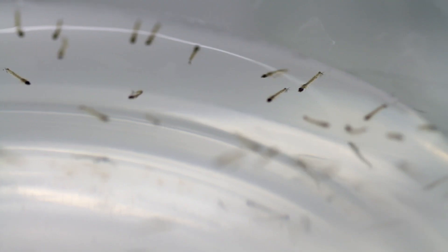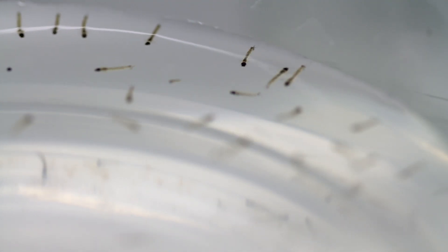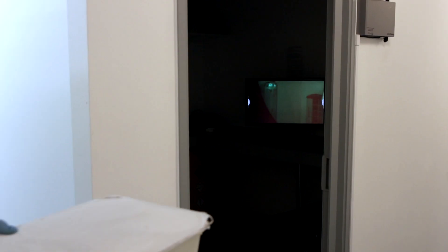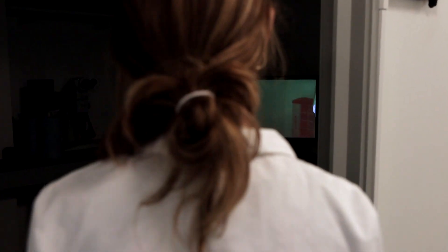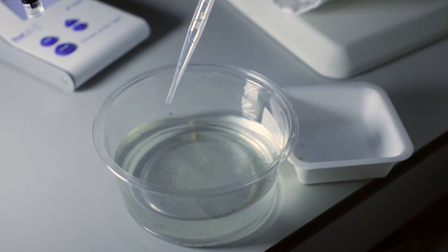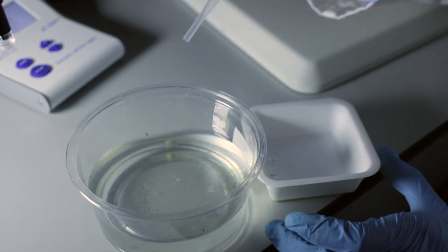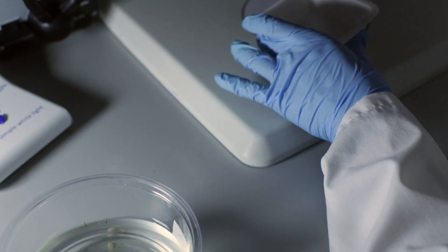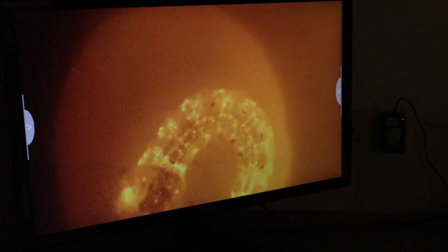We then carefully look after them for the next four or five days until they hatch into larvae, what we call the injection survivors. In the next generation, we can screen them already for fluorescence. We then monitor the offspring, looking for the fluorescent marker that causes the larvae to glow bright red under a fluorescent light. When we find those, we'll establish a strain and then test them to see if our self-limiting trait is working properly.